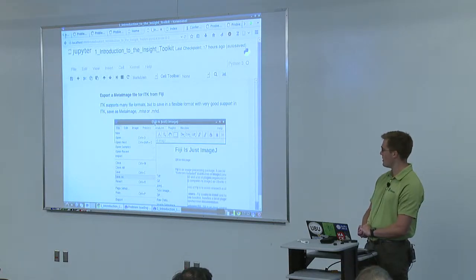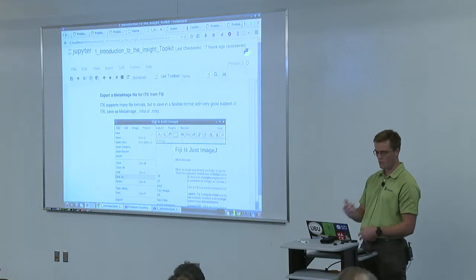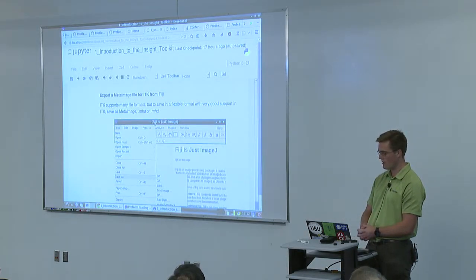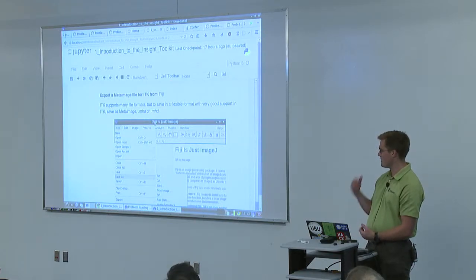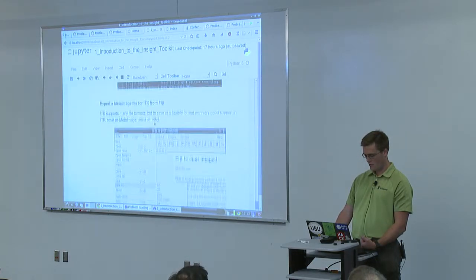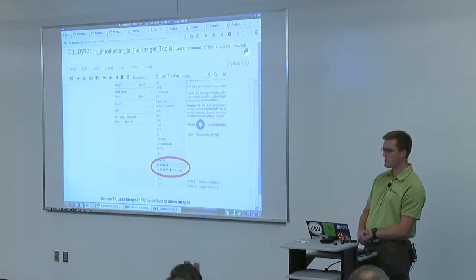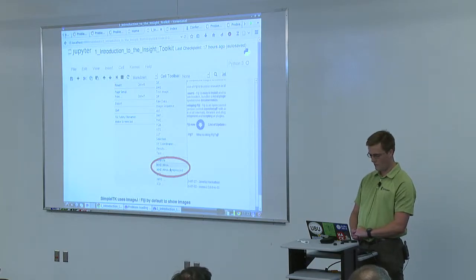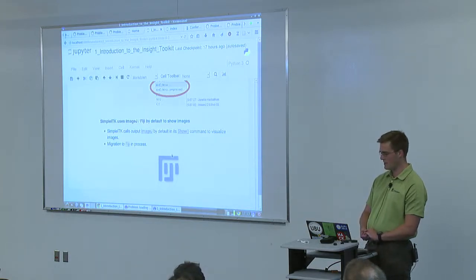If you want to go a different route and try to export images from Fiji into a format that has really good native support in ITK for n-dimensional images and the metadata surrounding the images, a good format to choose is MetaImage, and Fiji comes with a plugin to help you export that. You'll go to File, Save As, and then choose one of these MHD or MHA file formats, and that works for 2D and 3D. That will work very well with anything that's based on ITK or VTK.